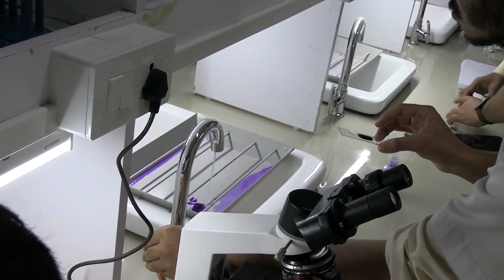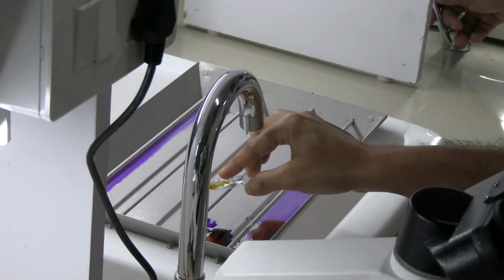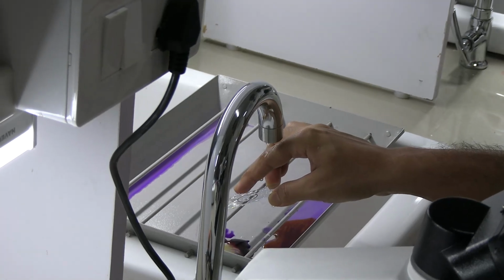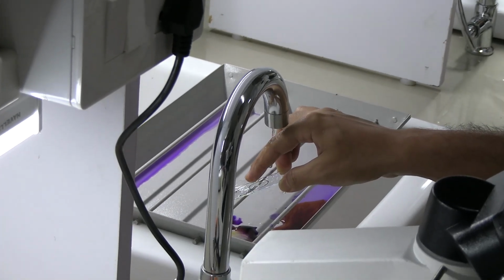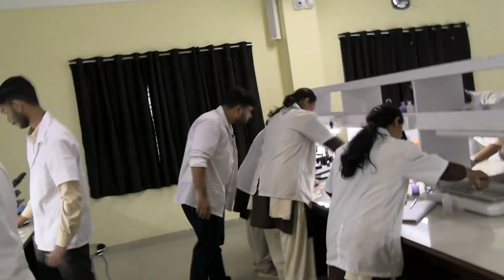Yes, sir. So you're gonna take this one. I have to wash it instantly. You're gonna put 2, 3 drops. You're gonna wash it instantly. Okay. I think that's enough. You're gonna wash it immediately. Very good. Okay. Just hold it a little bit higher. Otherwise, okay. I think that's enough. Okay. Are you guys doing the decolorization now? Okay.